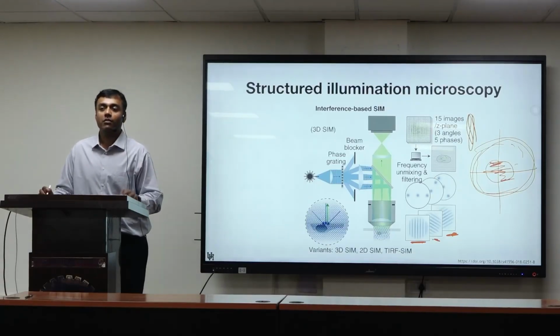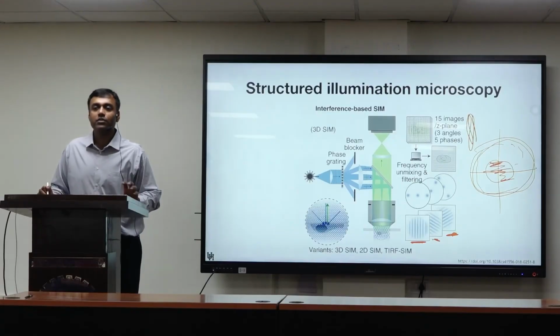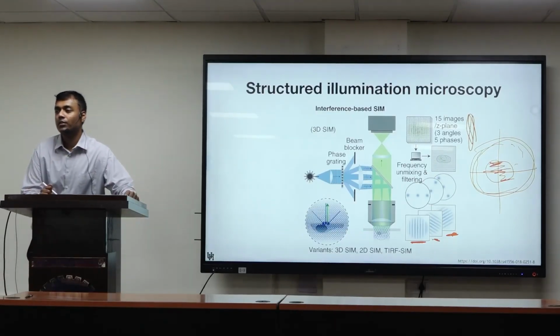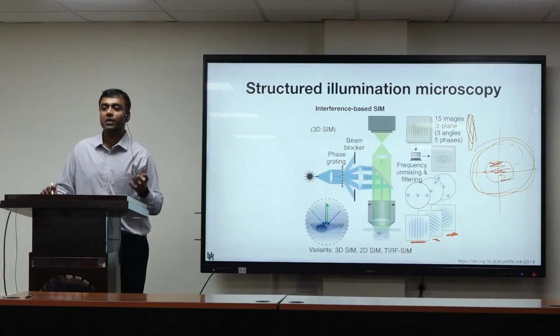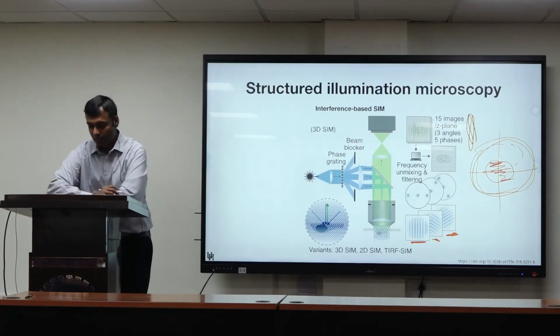Somebody thought, why not do this in a two-dimensional optical system? And this gives you much better resolution than you would otherwise. So this is one way of doing super resolution, doubling your resolution, better than the diffraction limit of light. Any questions?